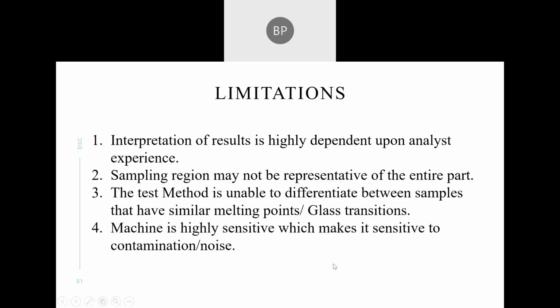So this machine is highly sensitive, and we need to make sure that there is no contamination, because the contamination to noise ratio is very high.